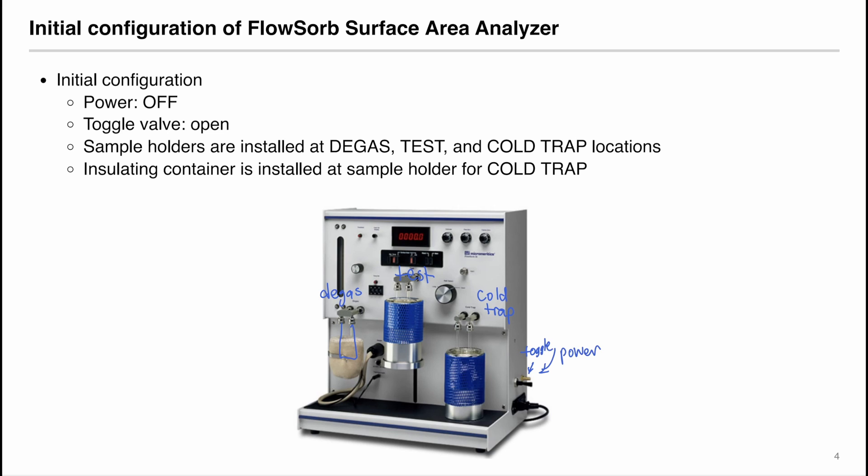When you're in the lab, you'll see that the insulating container is installed only on the sample holder for the cold trap. And this thing here is a thermal pad that will generate heat, so that the gas within the sample holder will come out. After making sure that the configuration is as described, we can then start our experiment.